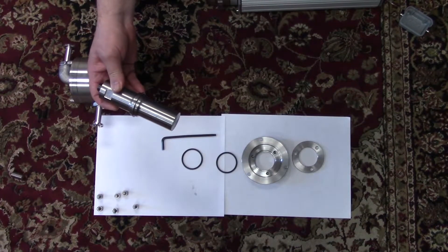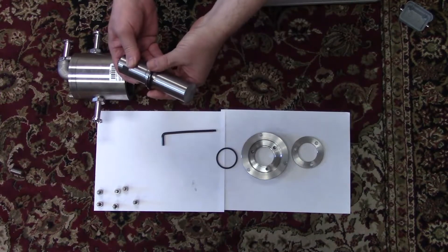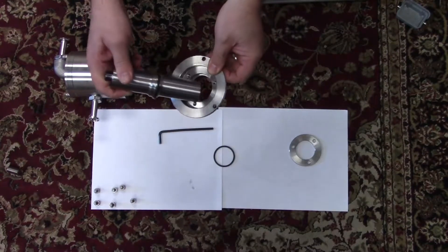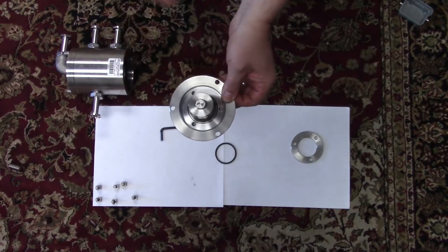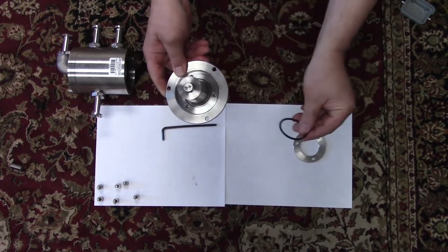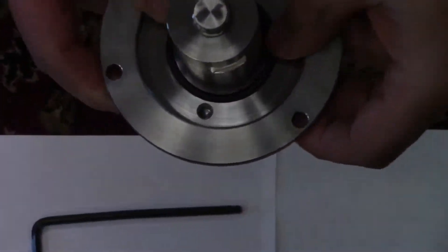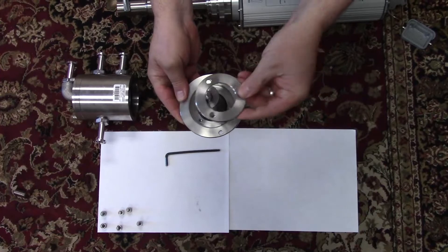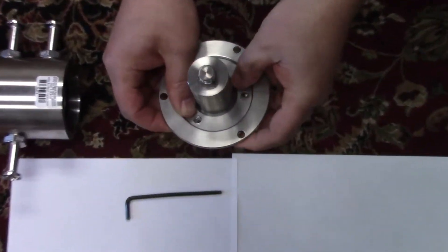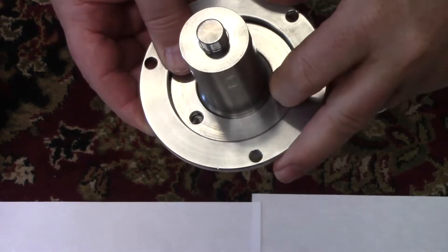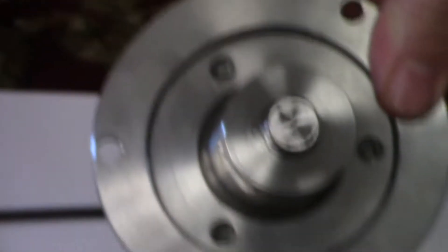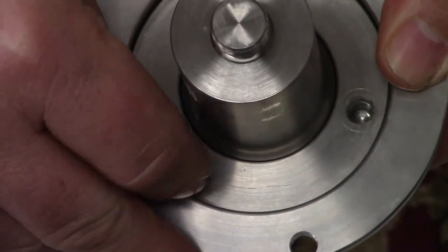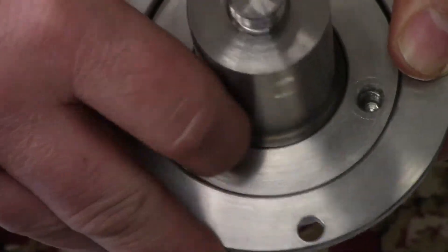I'm going to take the first washer and put it on the bottom. I'm taking the second washer. The next plate, positioning it right over. I'm going to finger tighten these and then tighten them later when the unit is secure.